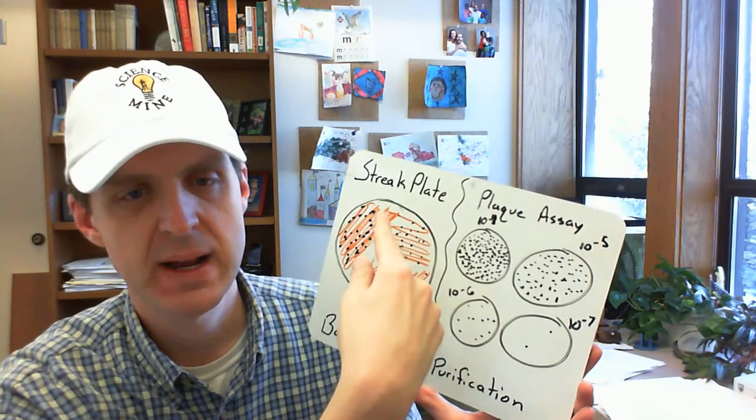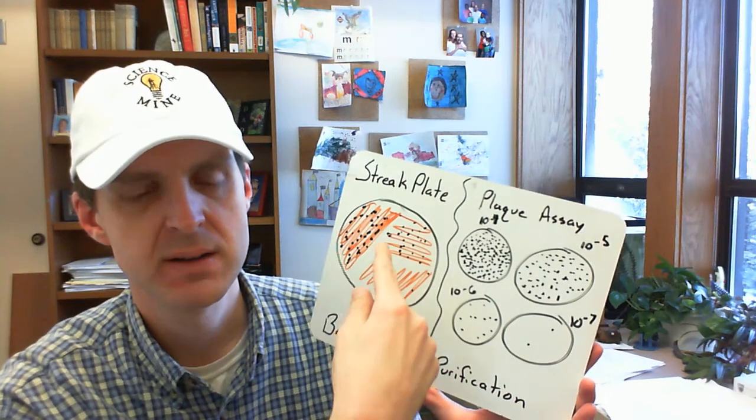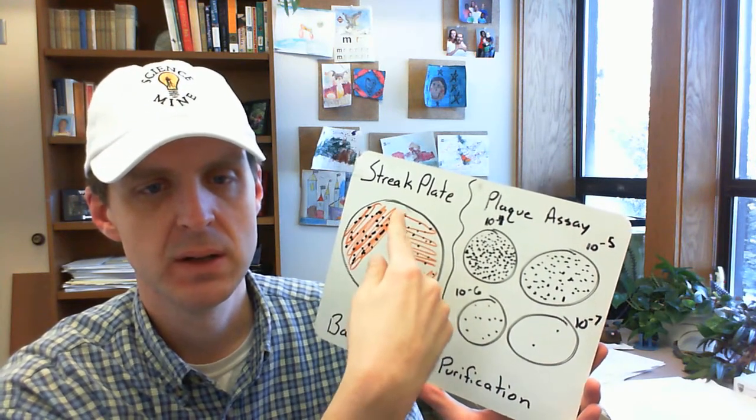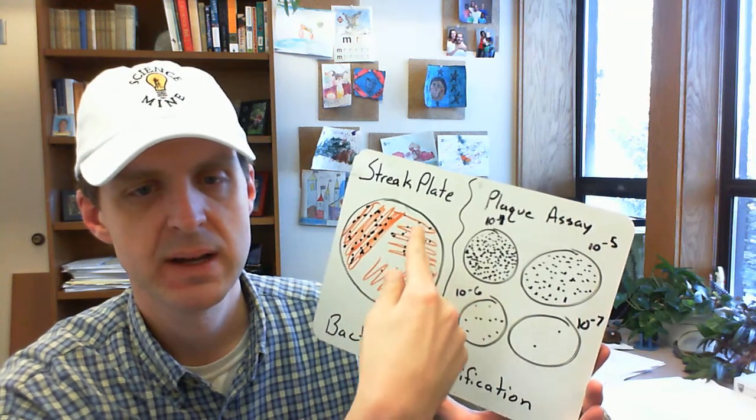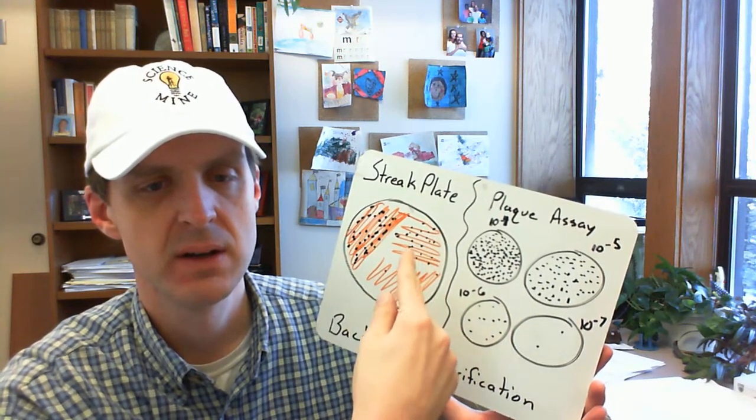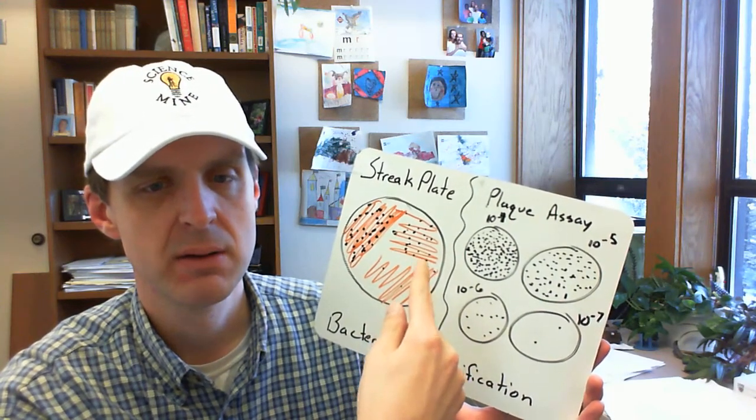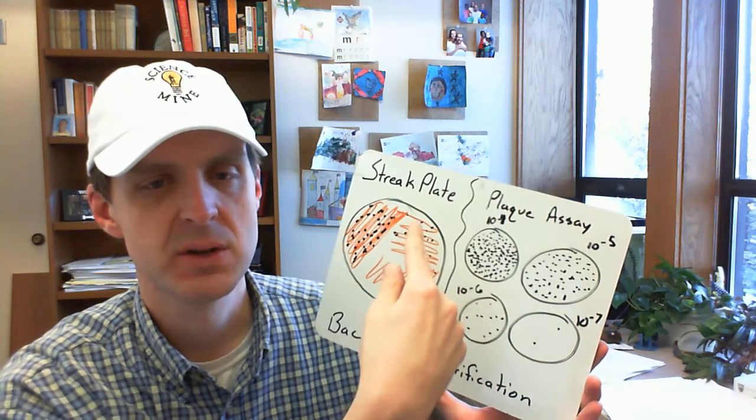You start out towards the end and then you work your way towards the middle and then you get a new tip and then you drag it through that area where there's probably a lot of virus and you then drag it through a little bit of that area and then streak it out.